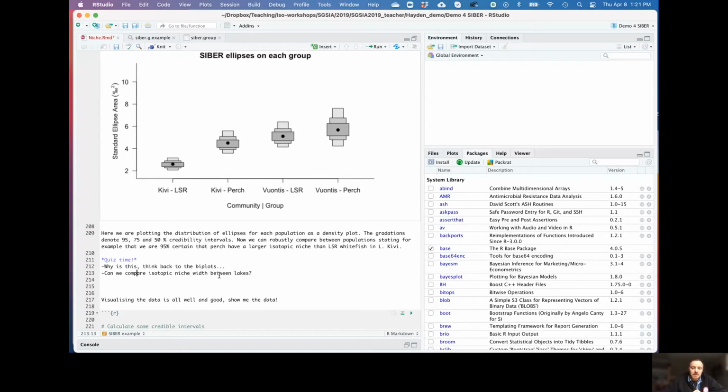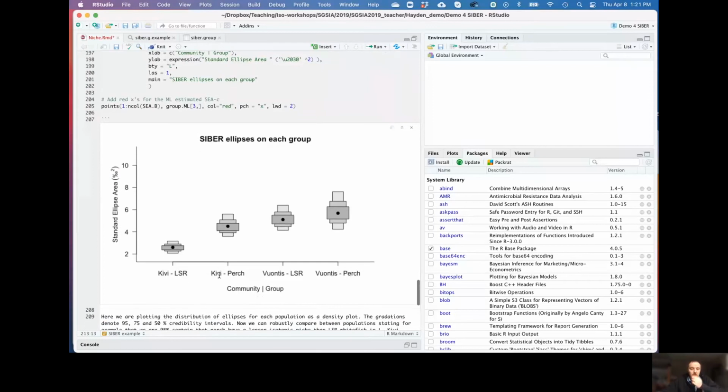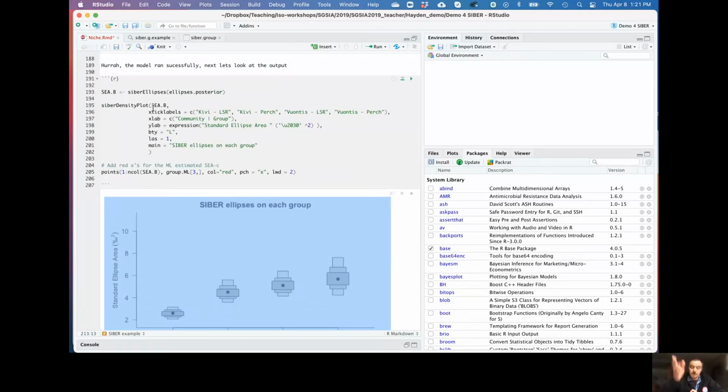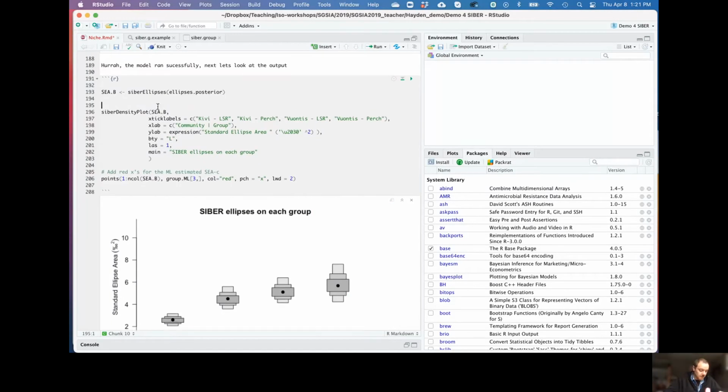So the last little piece I want to look at here is getting the actual data. We know how to make the plots. If we do this in ggplot, or in RStudio, we could just save that figure as a PNG if that's what you want to do, or you can use essentially the typical way to save figures in R. Seeing as we haven't actually done this, I'm just going to very quickly show you how to do that.